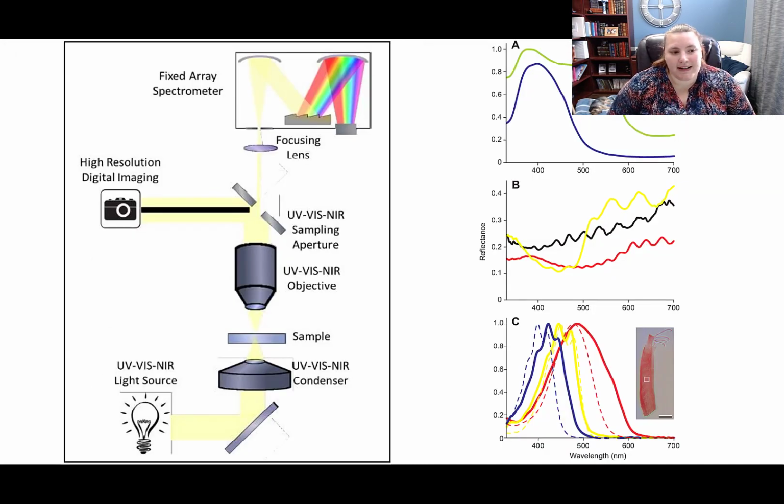A spectrometer is another instrument that can be added to a microscope to aid in forensic analysis. A spectrometer is designed to measure color. So when used in a microscope, it allows for what is known as microspectrophotometry, or an area of microscopy focusing on the identification of color within a substance.